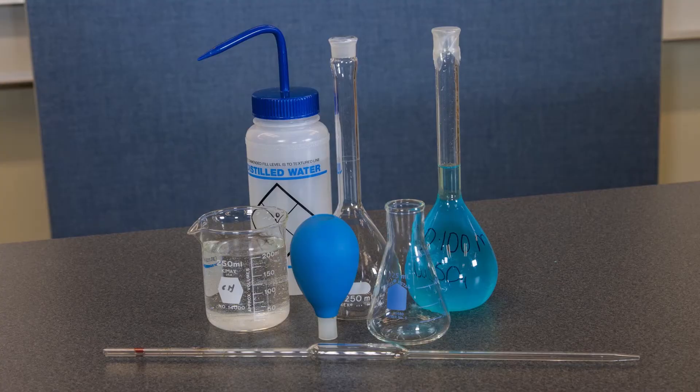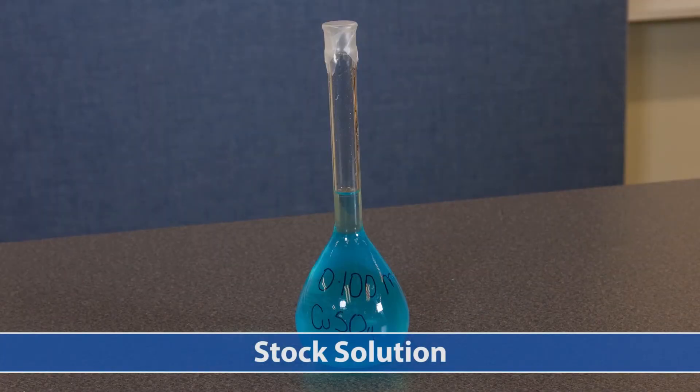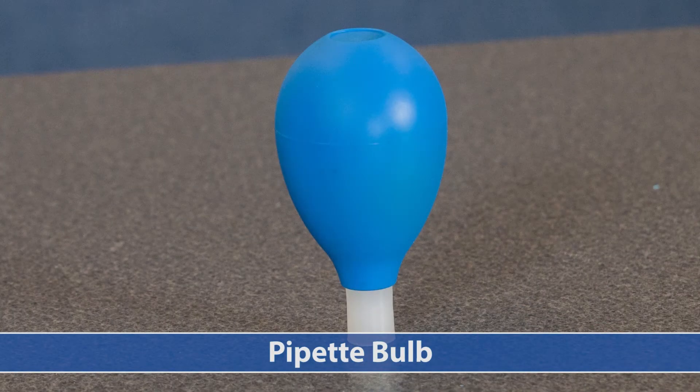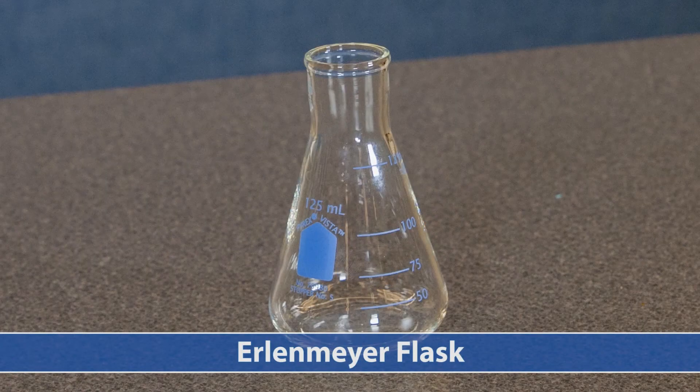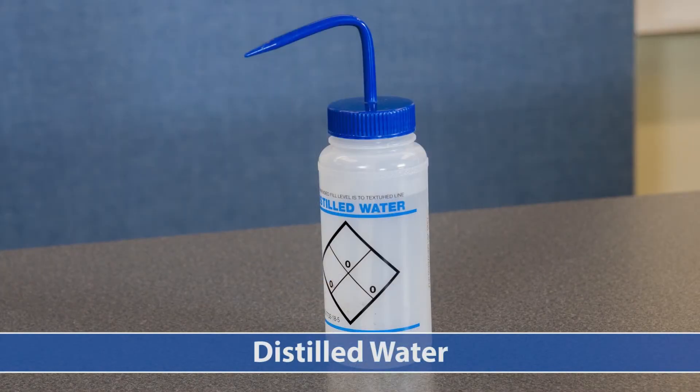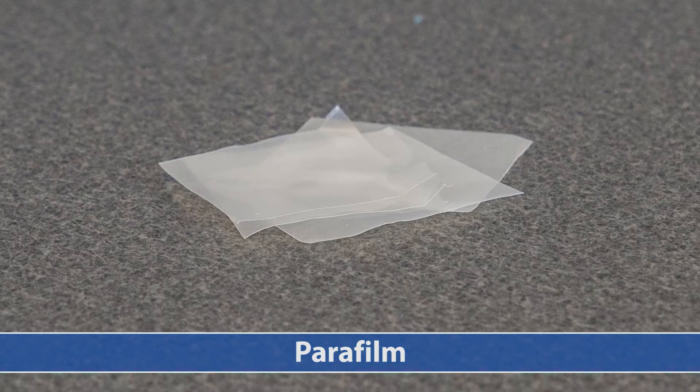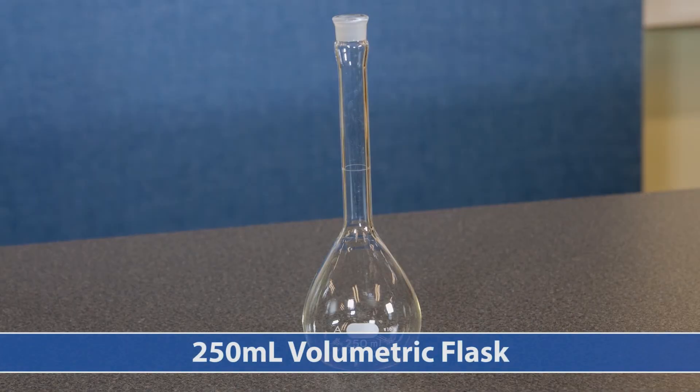To prepare the dilution, we will need the following material: stock solution, a 10 ml pipette, pipette bulb, Erlenmeyer flask, distilled water, disposable pipette, parafilm and a volumetric flask.